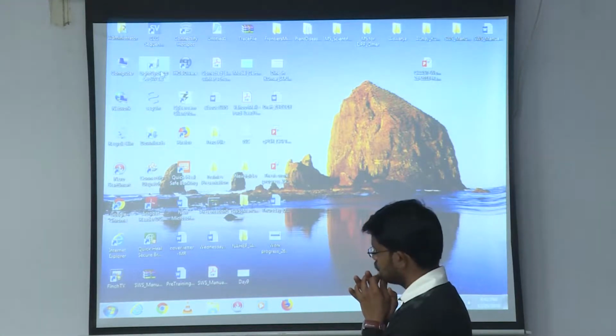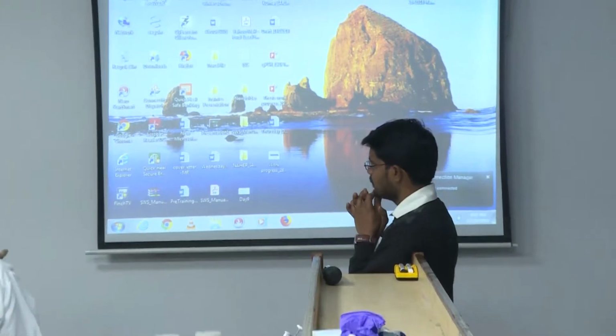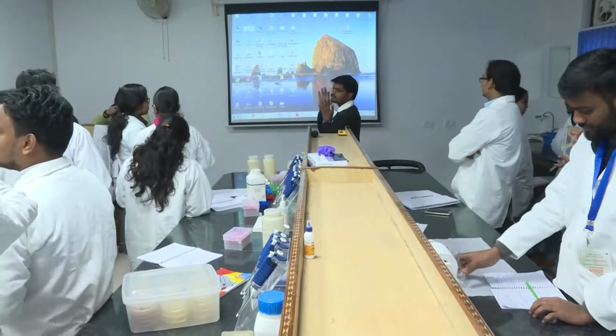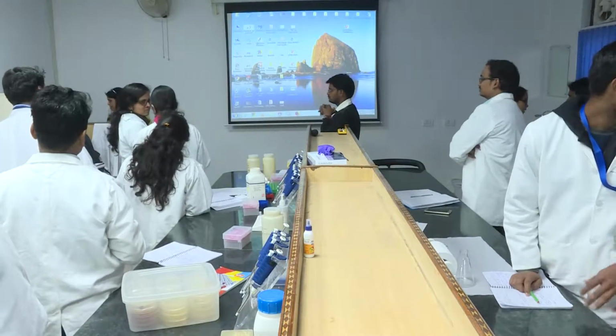While setting up in that machine also, please always write it down. Otherwise, if you put your sample at a different position, then you will not get any type of nano picture. That is what I am saying: since we have taken the picture, now we are confirmed, otherwise we could have messed up, right?